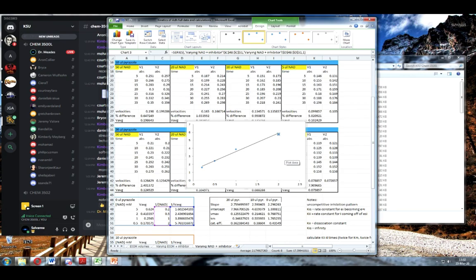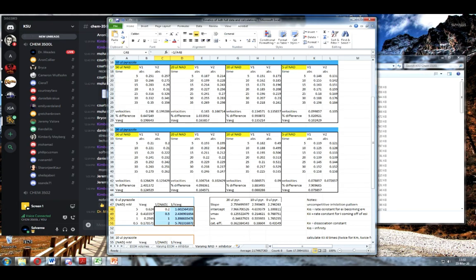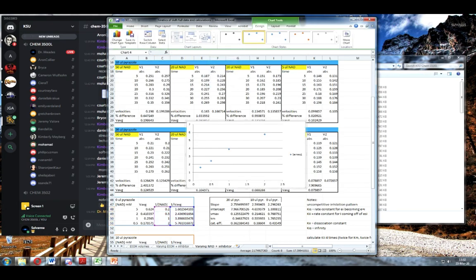And we already said on the previous graph, where I took the slopes, the averages versus the concentrations, that this point looked a little high. That one there should be a little lower, because it should make a nice hyperbolic curve. If this point were a little lower, that is the point on the other graph. We make the other graph again. That is this point on this graph. And if it's a little high on the first one, it's a little low on this one. So this one should be a bit higher, and it would line up with the others.